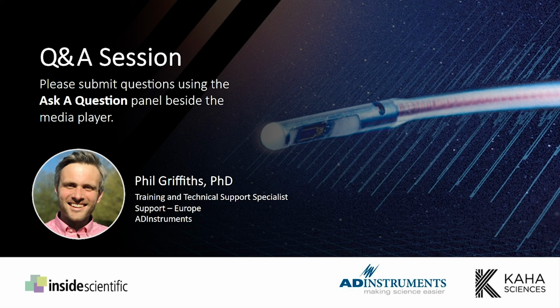Because it's a 2 French sensor, which is 0.6 millimeters, beneath the skull there's plenty of room for that to be positioned. In the spinal cord, around the spinal cord, it's certainly possible, I think, but it would just be a bit of a tight squeeze.